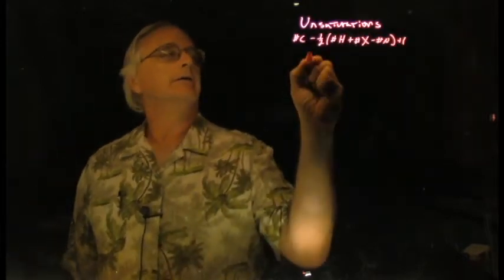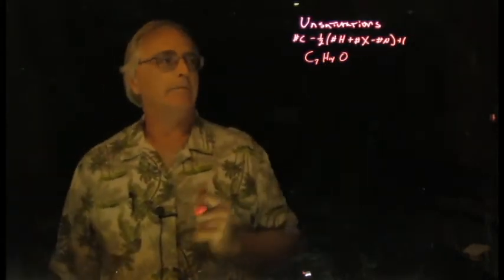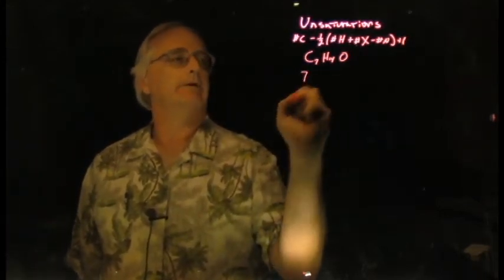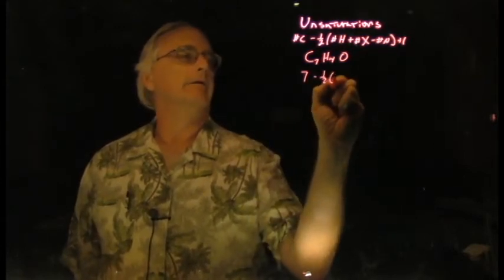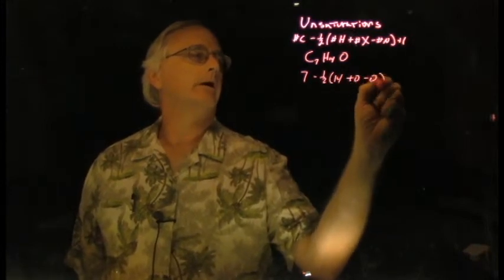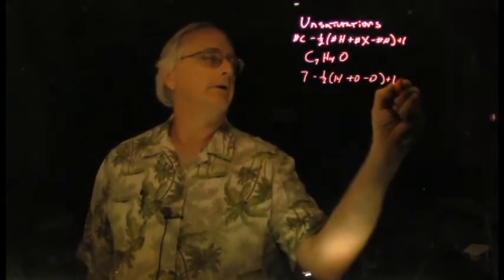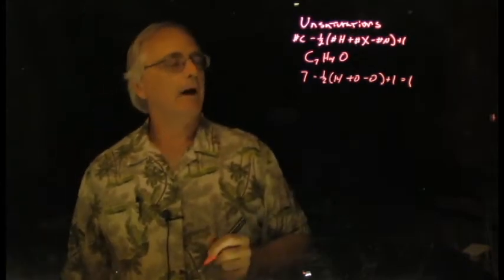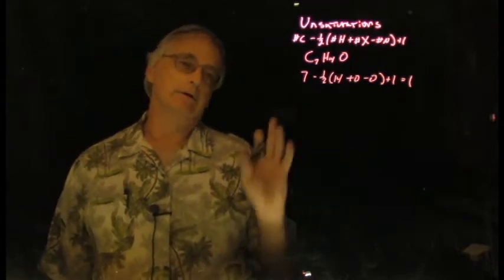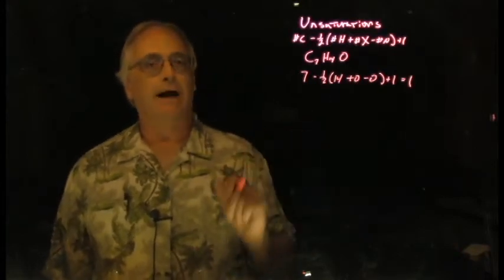First unknown. The formula is given as C7H14O. So there's the molecule here. If you're given a formula, it's always a good idea to do the index of unsaturations. Number of carbons, 7, minus half of the number of hydrogens, 14. No halogens, no nitrogen, plus 1. 7 minus half of 14 is 7 minus 7, plus 1 is 1. 1 unsaturation in this molecule. And so it can't be an aromatic molecule, there's not nearly enough unsaturation, but there is either a ring or a double bond somewhere in this molecule. So right off the bat, we know that information.